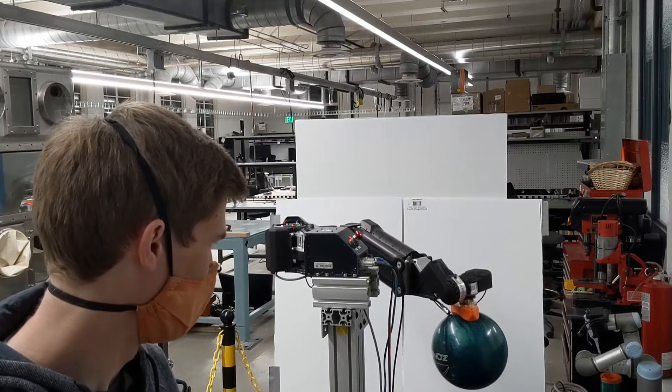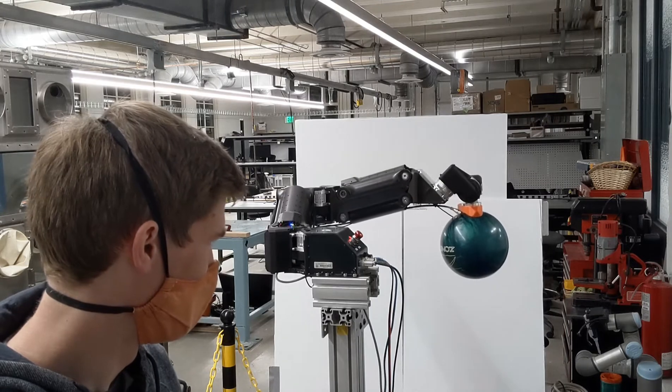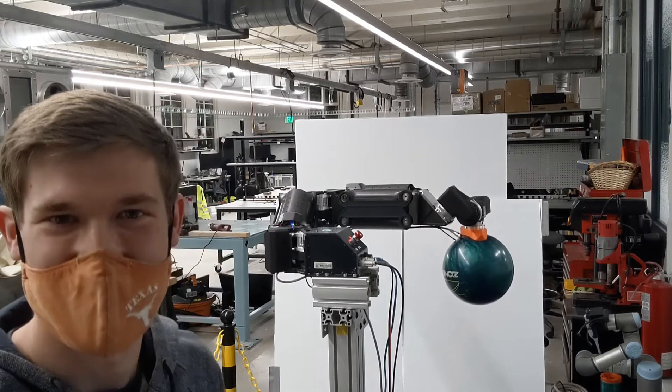I'm moving it pretty slow, because I'm kind of worried. But it seems to be doing pretty well. And before it breaks, I'm going to call it there.